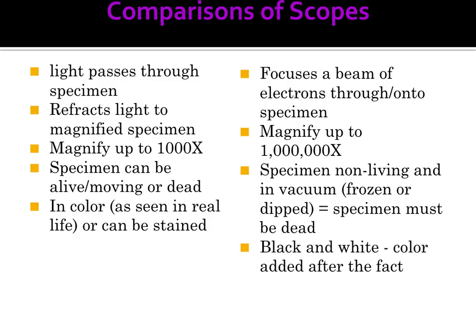And they do give us pictures in black and white. The only way to add color to these is to add the color after the fact. So you're basically not photoshopping, well, maybe that's what I want, but you're touching up that picture after the fact and adding that color to allow the person to see the differences. But everything is in black and white with those.